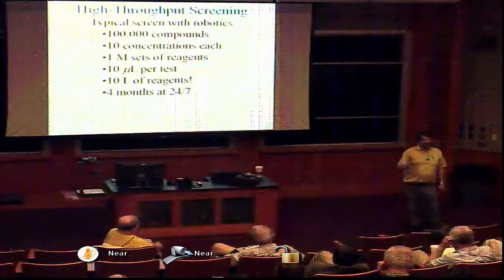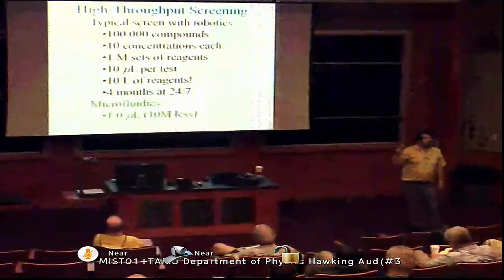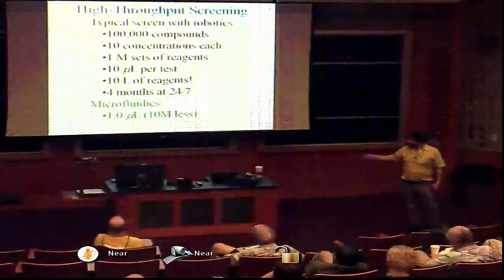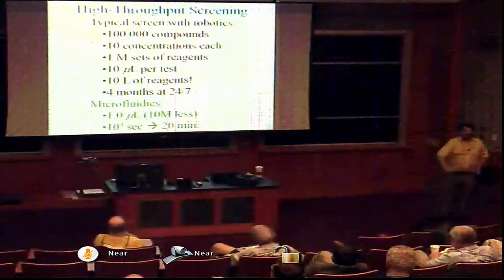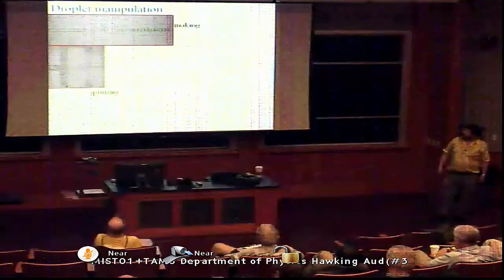If you do it with microfluidics, with a picoliter, and you do a million experiments with a picoliter, you use a total of 1 microliter of reagent. 1 microliter is less than 1 experiment. You do it 1,000 per second, you do the whole experiment in 20 minutes, and it's done. Go out, have a cup of coffee, come back, and it's done. This is very powerful, but if you want to do this, you better be able to control things the same way that you mix and match. And that's what we've worked for years to perfect.